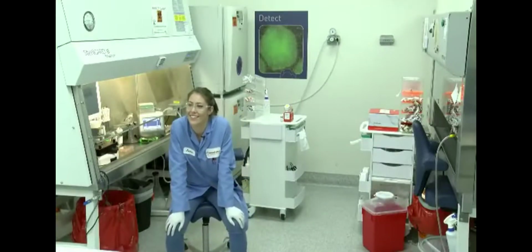And then buffer E versus buffer E2, which are both supplied in the kit: buffer E is used with the 10 microliter tips primarily, and buffer E2 is used with the 100 microliter tips primarily. And I think there's a difference in osmolarity between the two, and they're optimized for the 10 microliter tip or the 100 microliter tip. All right, that sounds really good, because that sounds like you can use one buffer for the majority of adherent cell lines. Exactly. All right, thank you.